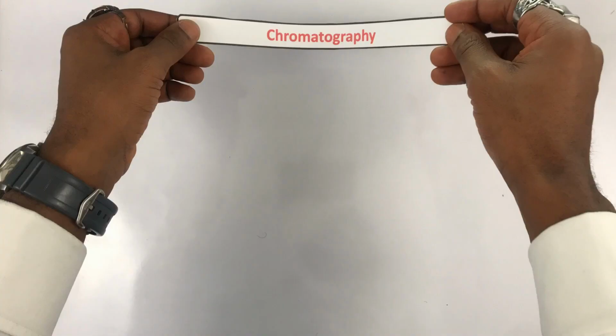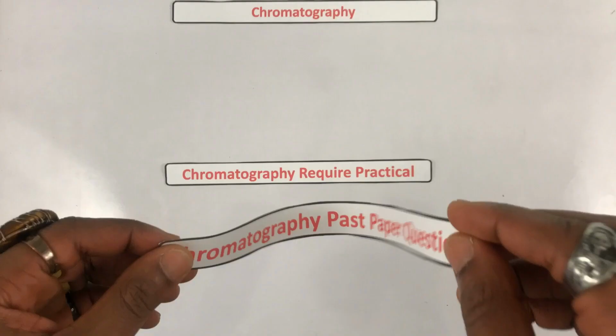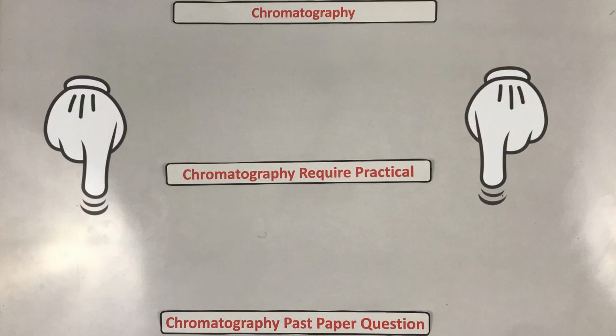I'll first go through the theory behind the mechanism, then I'll jump on the practical itself, and then we'll look at a typical question you might get. Check out the timestamps below to skip to exactly what you need.